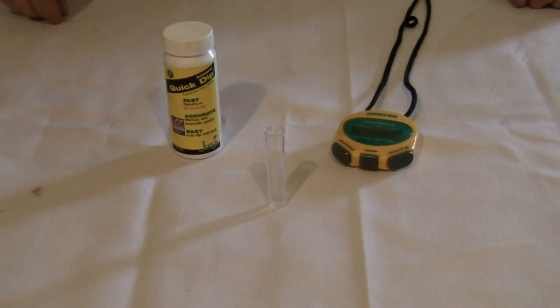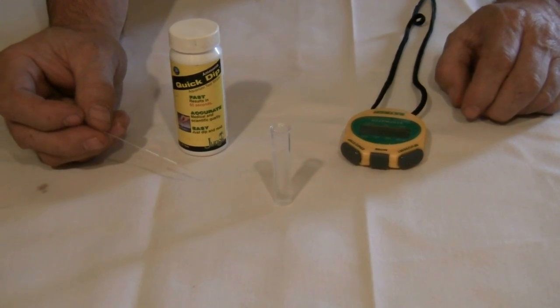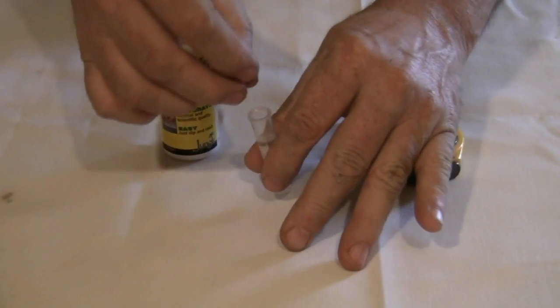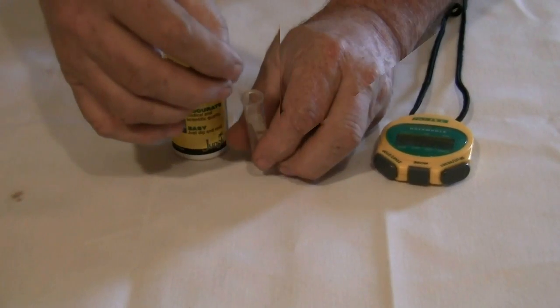Using the vial in the test kit, collect a sample of water from the tank. Most test kits include these small vials. Do not dip the test strip directly into the tank. Dip the test strip into the vial and agitate for 30 seconds.